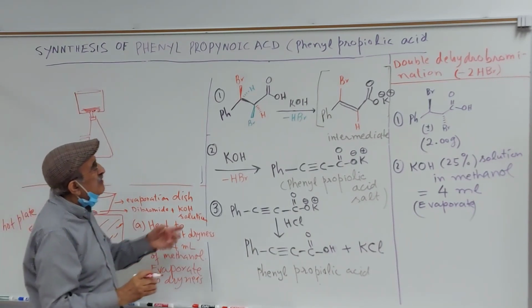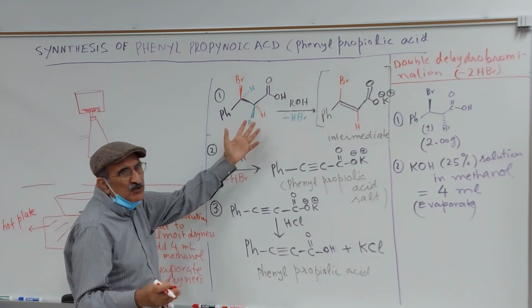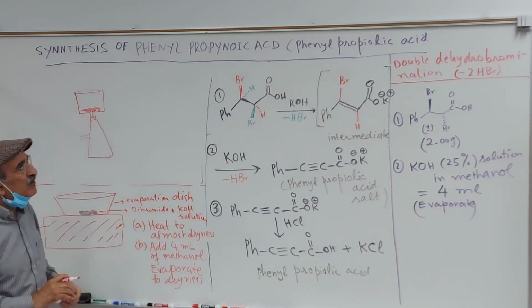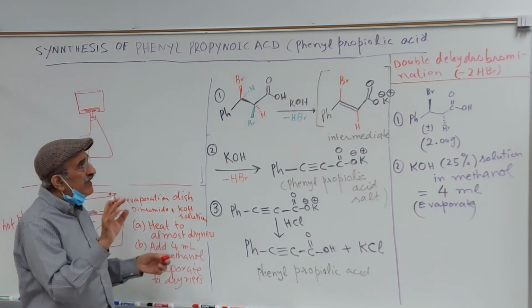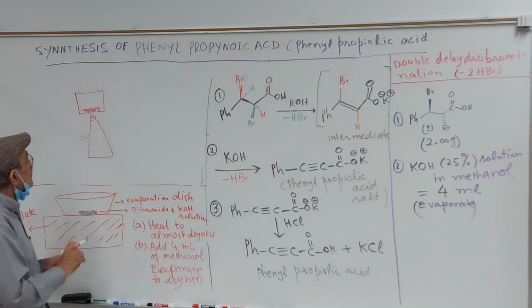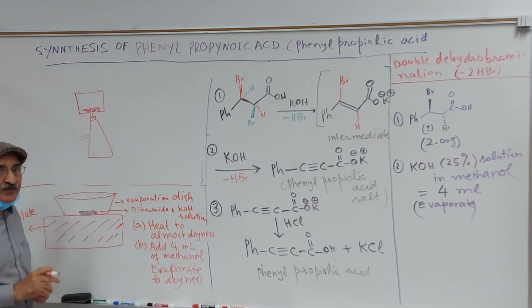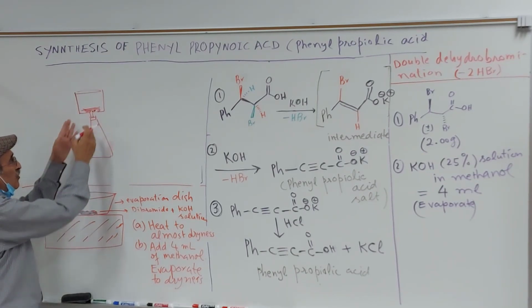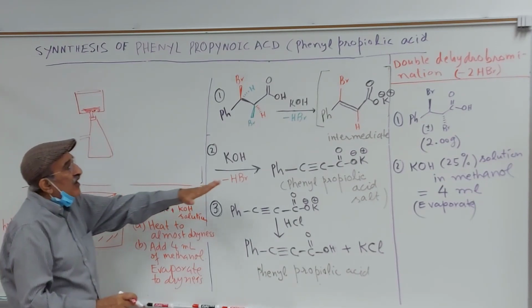The yellow stuff actually comes out of decarboxylative bromination. This is a side reaction, you cannot stop it, and it gives you a nice smelling compound called hyacinth flavor. But you know, that's not the main product, that's a side reaction. So that's the yellow stuff. You need to wash this cake, I'm sorry, the yellow stuff, with methanol. Now methanol dissolves the byproduct over there and leaves behind only the salt.